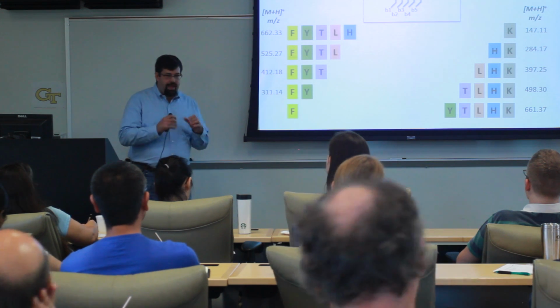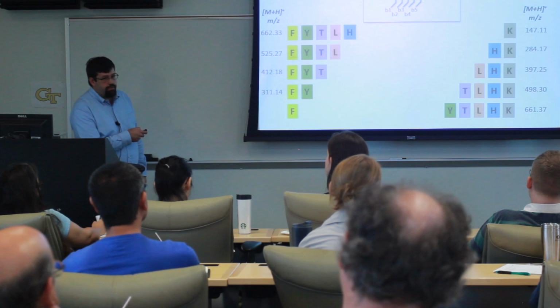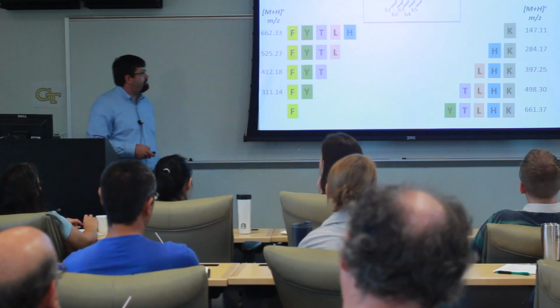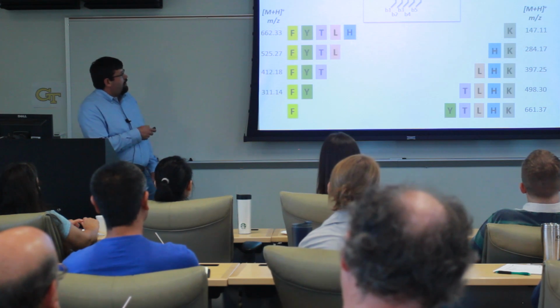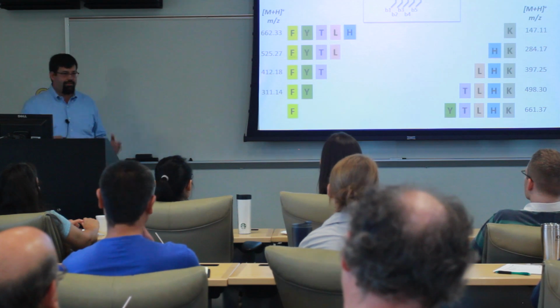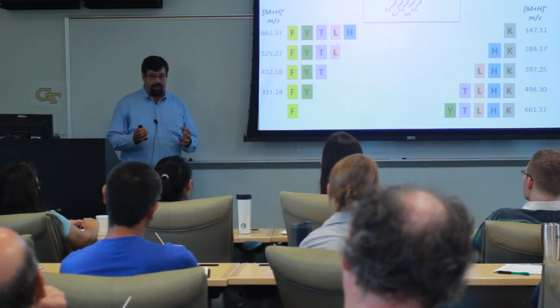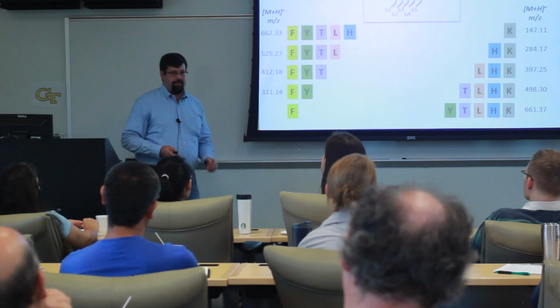We've matched the exact mass of the full-length peptide sequence, and then we've observed various fragments throughout that peptide mass that have matched a peptide in a theoretical digest of a sequence database. And we can label it like so. We may not always observe all of the fragments. In fact, most times we don't. We see a fraction of those fragments. Again, same concept applies. The more fragments that you identify that match this theoretical peptide, the higher the probability it is that you've actually identified that specific peptide.